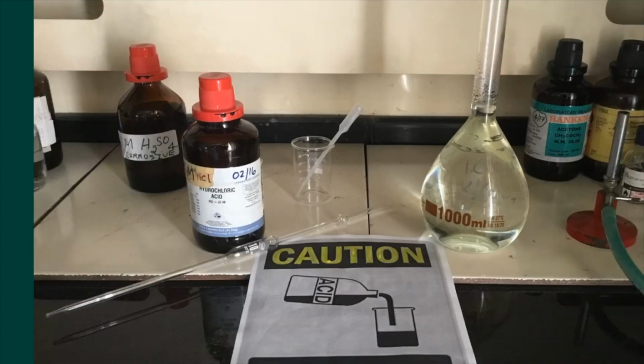If we were doing copper sulfate, then we could use a pipette like this to take out 10 milliliters of the original 1 mole per dm cube solution and place it into here, and then use distilled water to slowly make the solution up to the graduated mark here in this volumetric flask. Bearing in mind that when we get somewhere around the neck, we would cap the vessel, rotate it a few times, make sure everything is dissolved, and then slowly using a dropping pipette add water until the meniscus just touches this graduated mark on the volumetric flask.